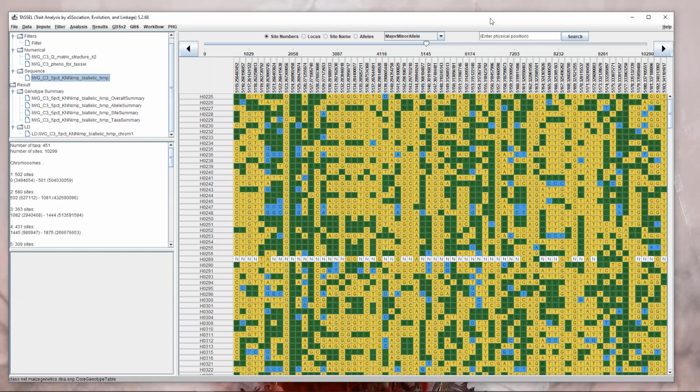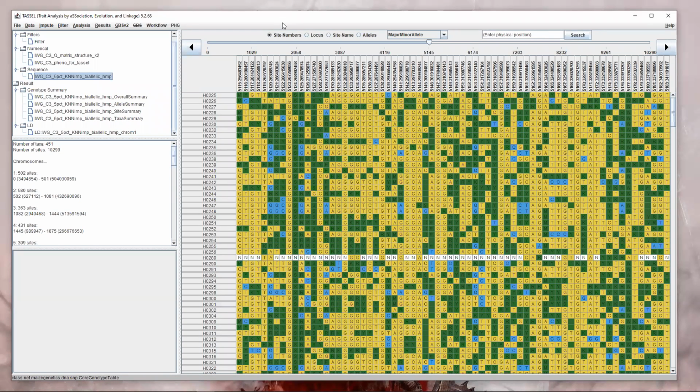I have another question. Why was it not able to calculate the LD for those ones that came up as squares? That's a great question. I do not know, I'll be honest. It could be because there is no relationship. Sometimes that happens. If the loci are very far apart, maybe there is no meaningful relationship to report, and that's been my understanding.